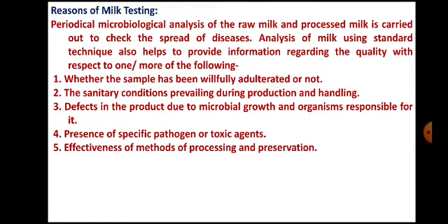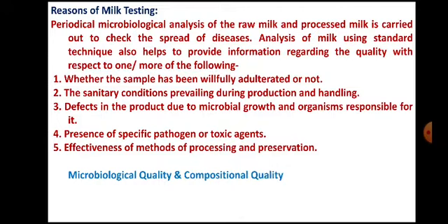Effectiveness of the methods of processing and preservation. Like, one of the best methods for milk preservation is pasteurization. So we can check whether the milk is properly pasteurized or not. That is the test for processing and preservation. So in all, these milk testings will be divided into two categories: tests to determine microbiological quality of milk and tests to determine compositional quality of milk.